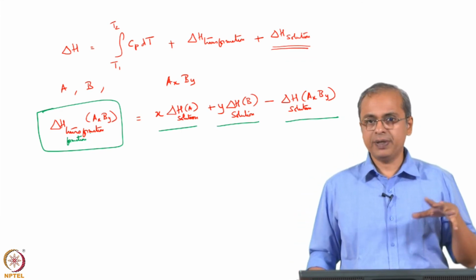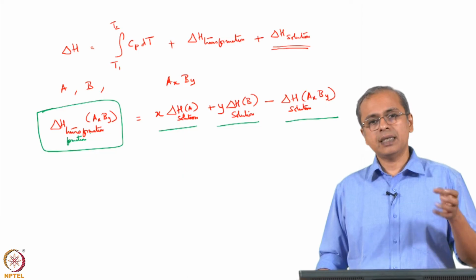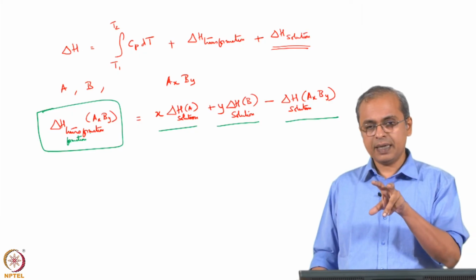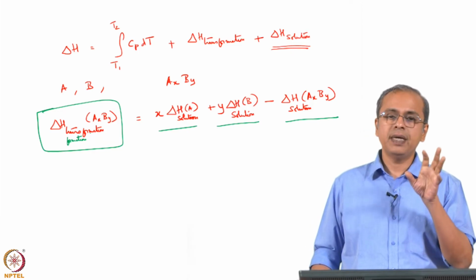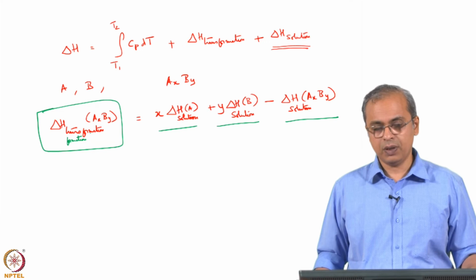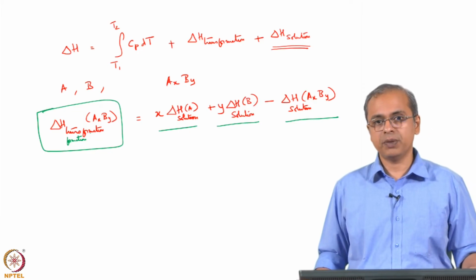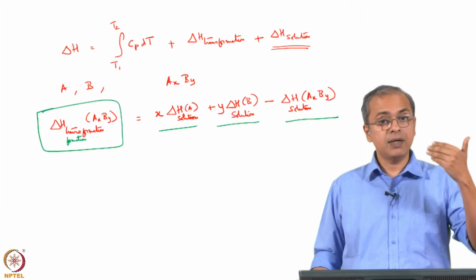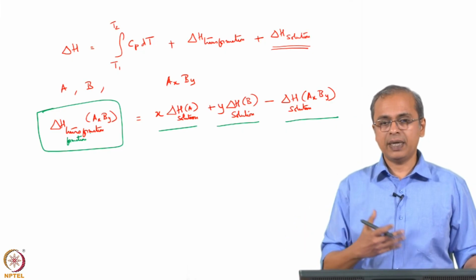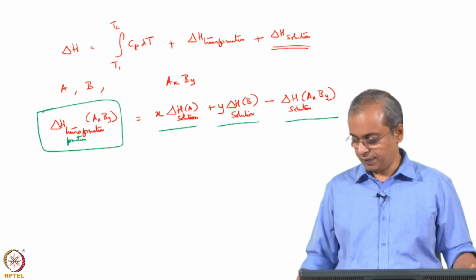Now, I showed you at least a few different versions of calorimetry. This is all at constant pressure, so you get Cp values. There is also a different version called a bomb calorimeter, where there is a container inside another container. The container where the reaction is going on is tightly controlled in volume and can withstand significant pressures, and that is a constant volume measurement, so you get a Cv value out of it. Like this you have a lot of different variations. As I said, this is fundamental from the perspective of thermodynamics, because it gets you the Cp value, Cv value and so on, from which you can get the enthalpy values. Much of the thermodynamic data that you get in terms of free energy changes and so on is related to these enthalpy changes, and therefore this is very important.